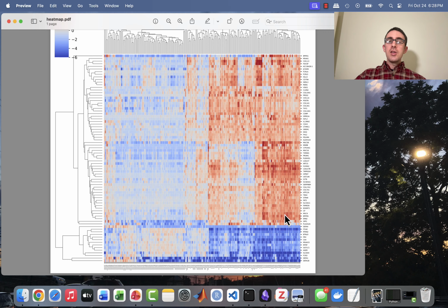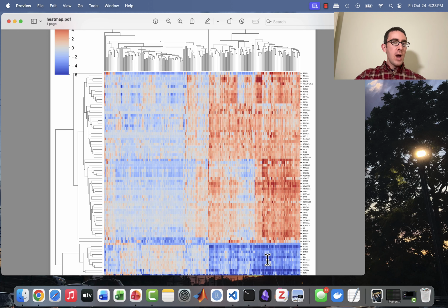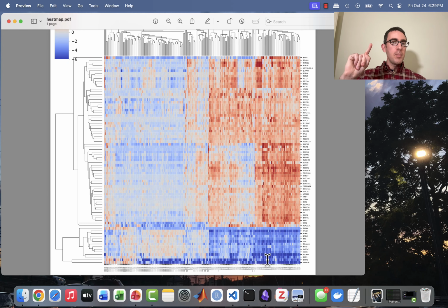And then the upper part of this is a lot of reds, meaning this selection of genes tended to have higher expression in these samples on the right compared to the means of the controls. So before I tell you guys, I want you to maybe pause and make a guess about what that tells us about these samples and these samples.